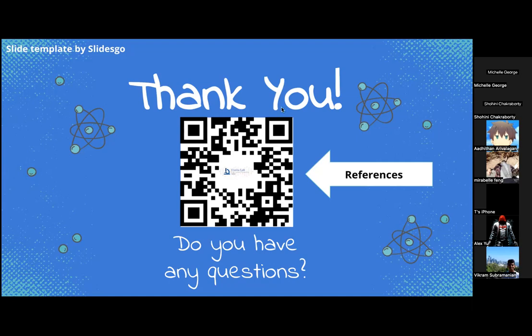And then Aditya, how does this thermocycler work by denaturing DNA? Yeah, the thermocycler has three different stages. It denatures the strand, and then it anneals the strand, which basically adds more DNA, and then extension, it again increases the temperature of the strand, and then DNA polymerase works to expand it. So in short, the thermocycler first denatures the DNA.